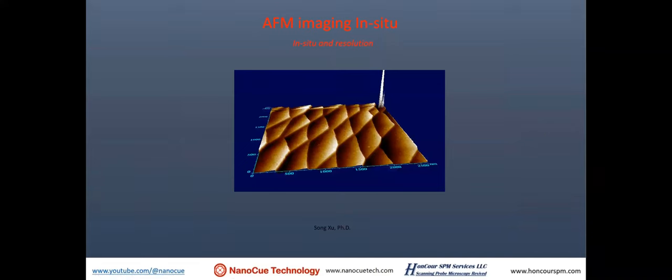This week, the topic we will discuss is the AFM imaging in situ. When we say in situ, we cover a lot of situations, not just imaging in liquid, but also imaging when the sample is in a different kind of environmental variations, like temperatures or like exposure to different gas.